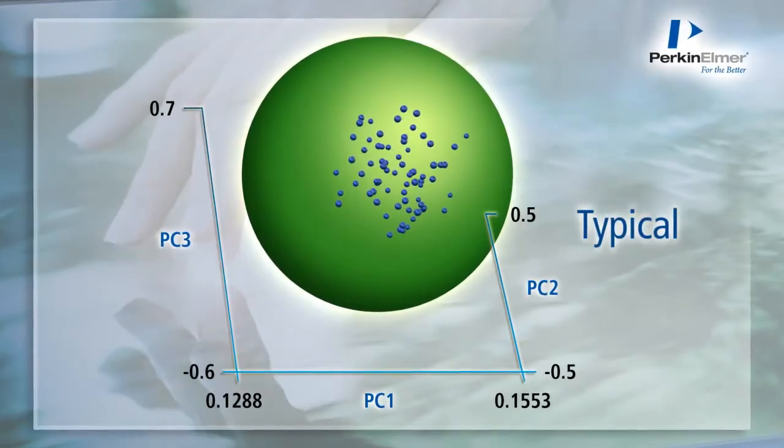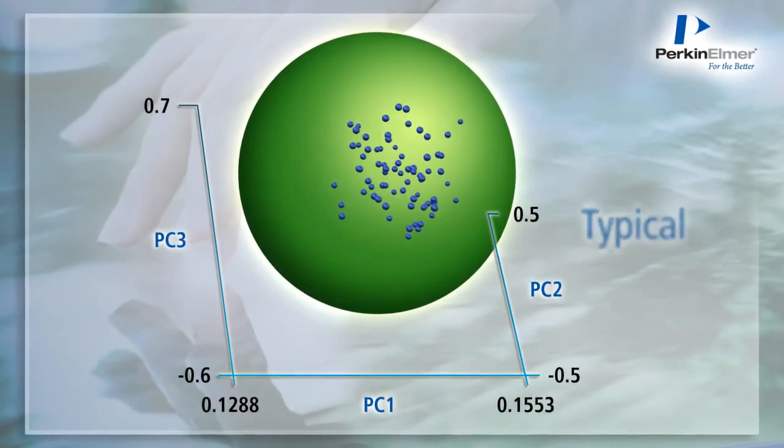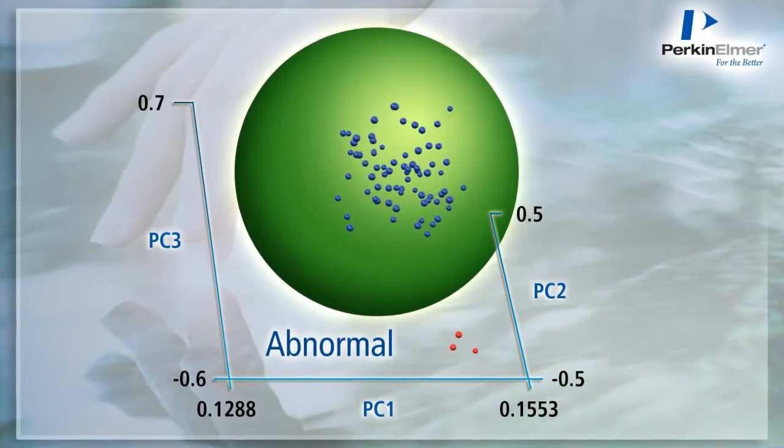Now, the real strength of near-infrared spectroscopy is that the spectrum is characteristic of the whole sample. So we can build a qualitative model for what normal milk powder looks like, and then look for deviations in the sample spectrum. This lets us do non-targeted screening for any adulterant, not just the ones we know about. The disadvantage with the second approach is that because we're not using any information about the spectrum of the adulterant, we don't get the same level of sensitivity as a targeted quantitative method can achieve.